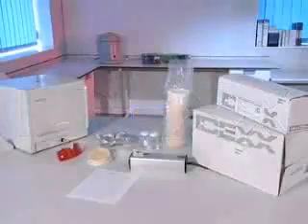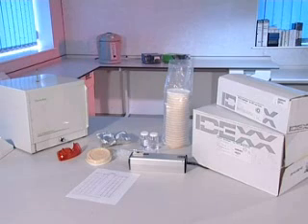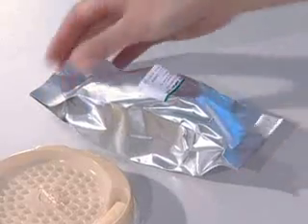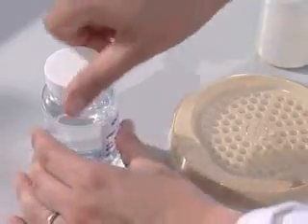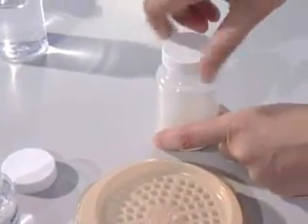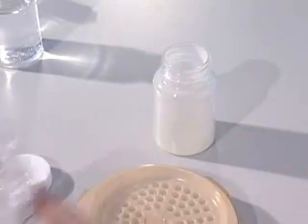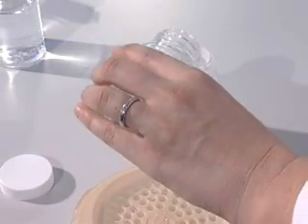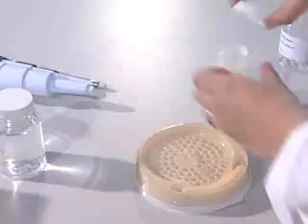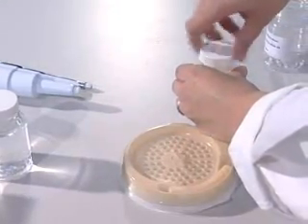This presentation will demonstrate SimPlate for HPC in its multi-dose format. To perform the SimPlate for HPC method, follow these easy steps: open the foil packaging containing the media, hydrate the media by filling the media vessel to the 100ml mark with sterile diluent, then recap the vessel and shake it to dissolve.